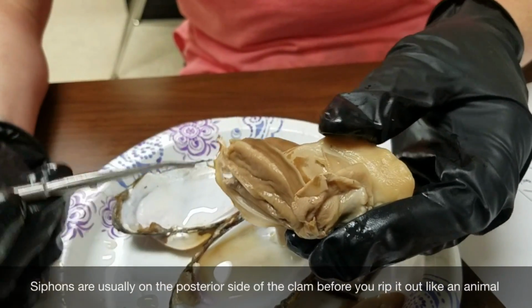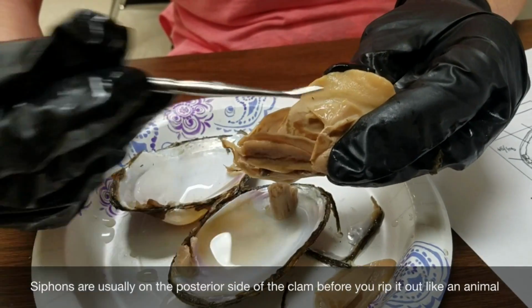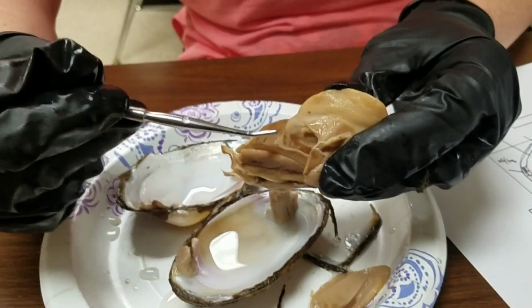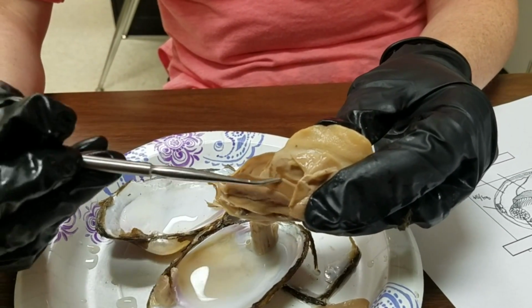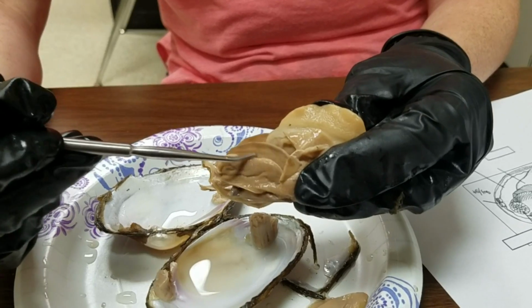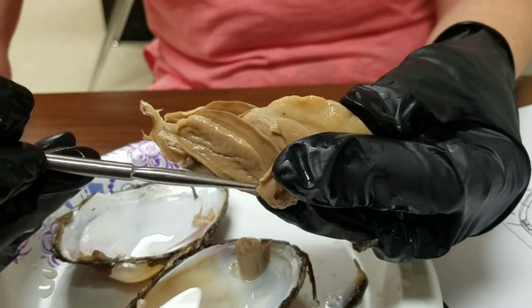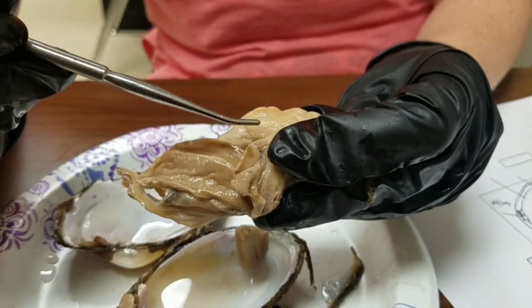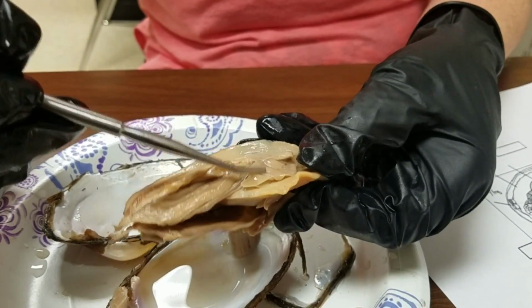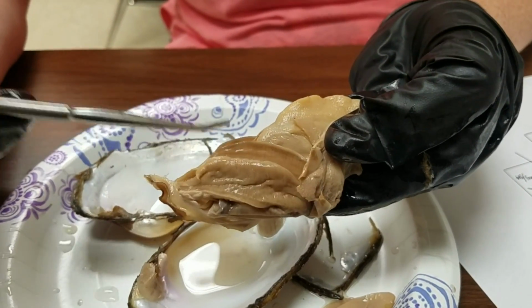Anyways, the siphons are going to look like two little tubes, and that's how clams get water in. They pump water into the body cavity, and the plankton and stuff stick to the gills, and then it's siphoned towards the labial palps. You can see there's labial palps on both sides, labial palps on this side, labial palps on this side. There's gills on this side, gills on that side. So there's two sets of everything.